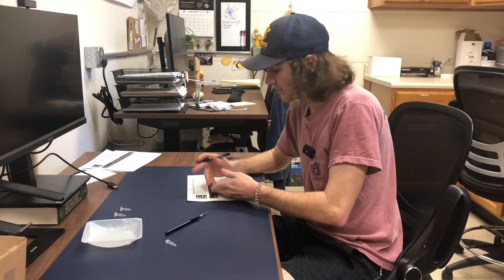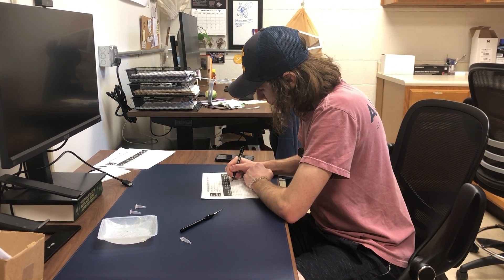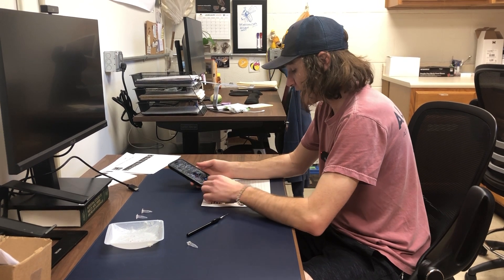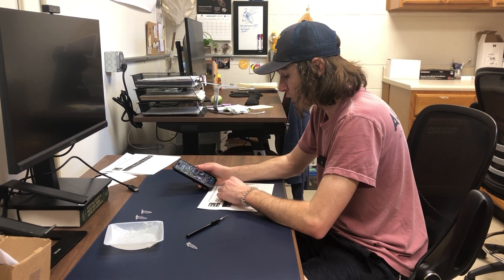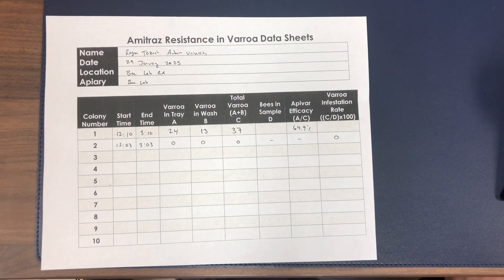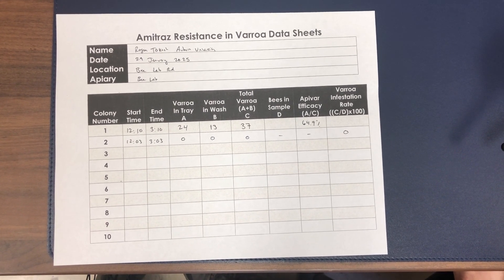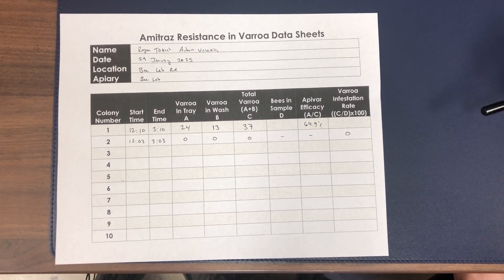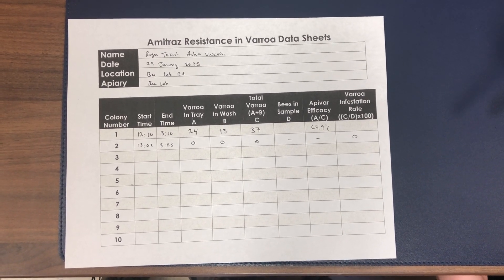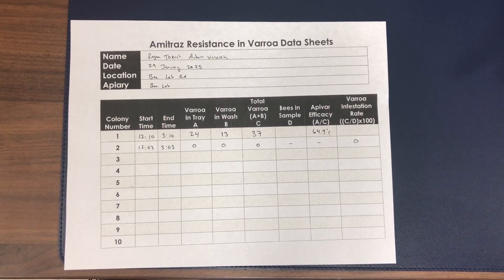Now I'm going to collect the mites from the weigh boat, counting both resistant and susceptible mites. I usually like to do an initial count on the weigh boat and then also count the mites as I collect them. Once we've collected all the mites from the tray and the wash, I add that to the data sheet and calculate the total number of Varroa. To get our Apivar efficacy, we take the total number of Varroa in the tray divided by the total number of Varroa in the entire sample. We normally sample 10 total colonies per yard. Fortunately, we didn't see any mites in colony number two, which is really good as a beekeeper because it means we have low Varroa mite counts — but it's not ideal for Amitraz resistance sampling because we never saw any mites.